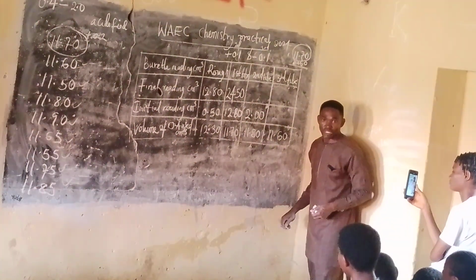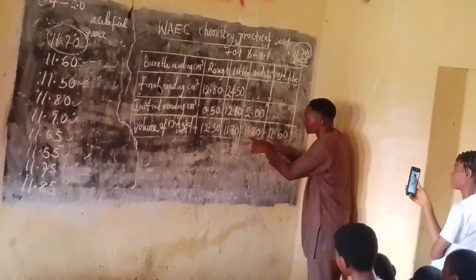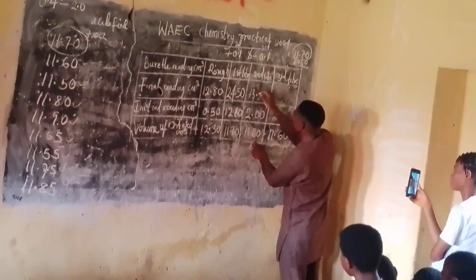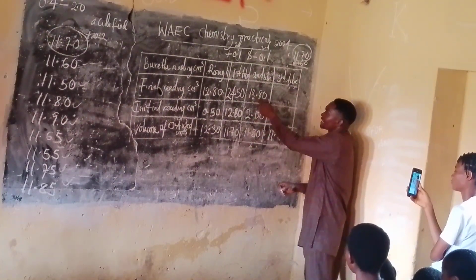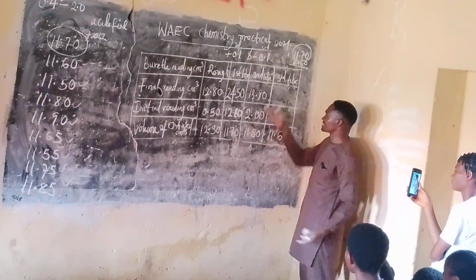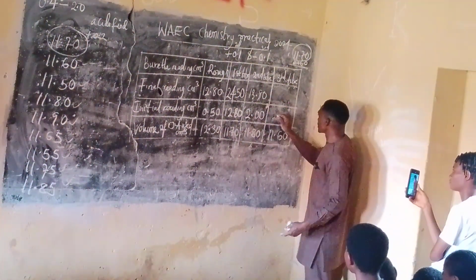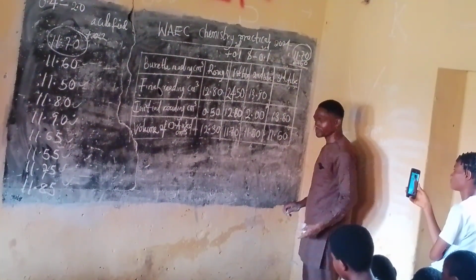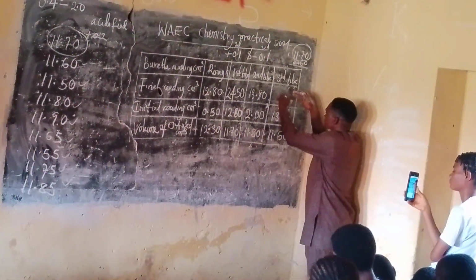2.00. Are you there? So I will just add this 2.00 to this value. So this will be 13.80. Created this one. I can now start. 13.80 is not up to half now. So I can then start here as my initial. Are you with me? So here will be 13.80. Add this one together, I'll get this final.